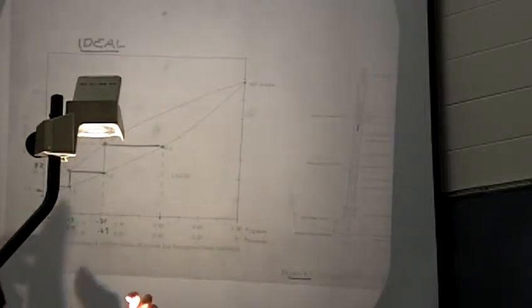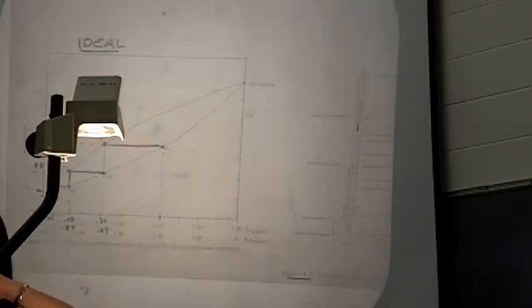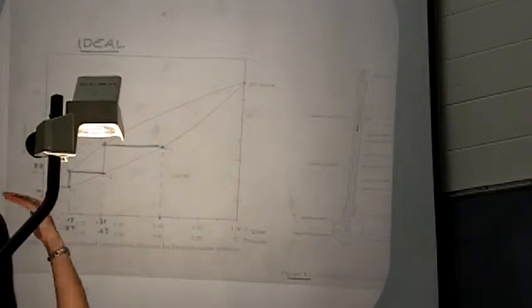Okay? And so all these mini simple distillations as they're going up the column are purifying that liquid to make it more all one component. All right?